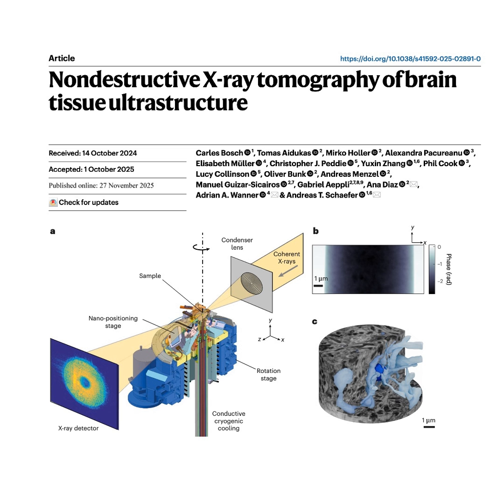Where did they even look for something strong enough to survive what is essentially nuclear-grade radiation? Well, they realized that the usual biological plastics were just not designed for this, so they started screening specialty resins that were developed for the most extreme radiation environments we know. Which would be what? The nuclear reactor and aerospace industries. Wait. They're using space-grade epoxy to image a tiny piece of a mouse brain. That's pretty much it. It's a fantastic example of cross-disciplinary innovation.